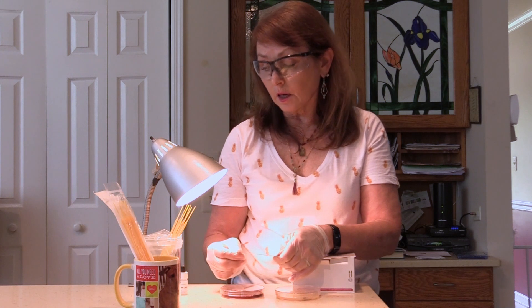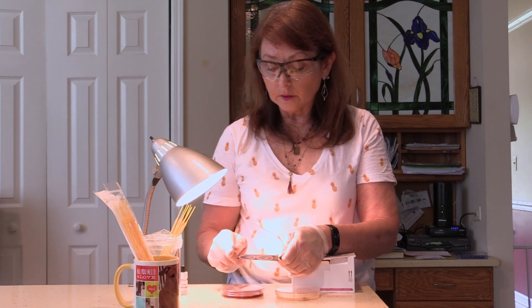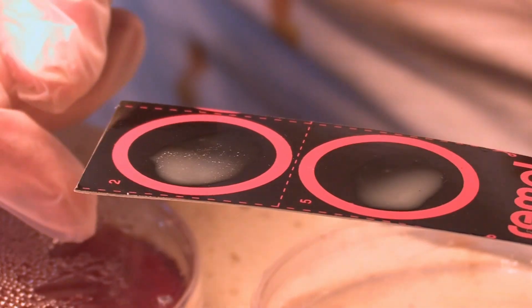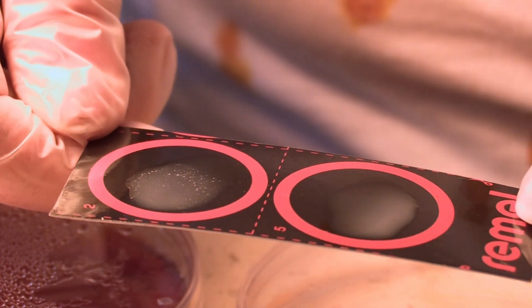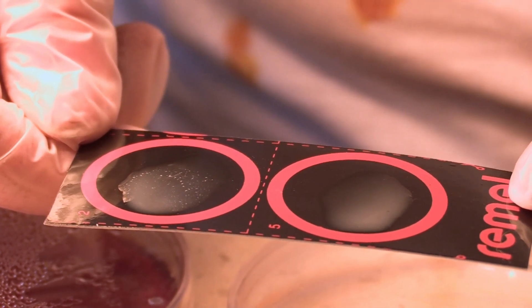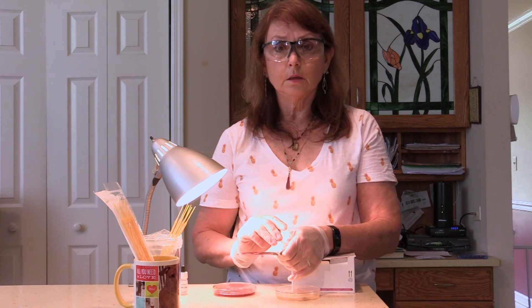It's always best to view these slides with a light nearby. As I take a look, I can clearly see that on the slide where I put the Staph aureus, there is clear-cut agglutination indicating Staph aureus — and that's what was on that plate. The other circle is completely smooth, which is where I put my Staph epidermidis. So using antigens and antibodies, we can quickly differentiate between two species on a petri plate.